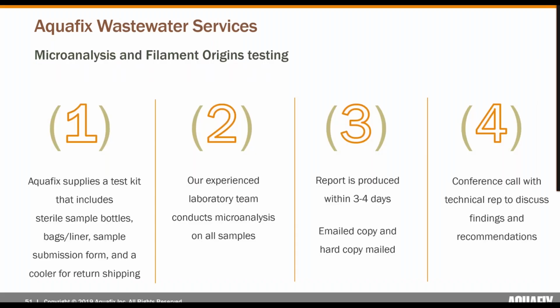We can take a further look at Aquafix's wastewater services as our microanalysis and filament origin testing process looks like this. First, Aquafix will be able to supply a test kit that includes sterile sample bottles, liners, sample submission forms, and a cooler for return shipping. Upon receiving a sample at our lab, our team will immediately begin to conduct microanalysis on all samples received as explained earlier. Typically, a report will be produced within 3 to 4 days upon receiving a sample, and we will deliver a report in hard copy form as well as an emailed copy. And then finally, a conference call can be scheduled with technical reps to discuss findings, as well as treatment recommendations from the laboratory.